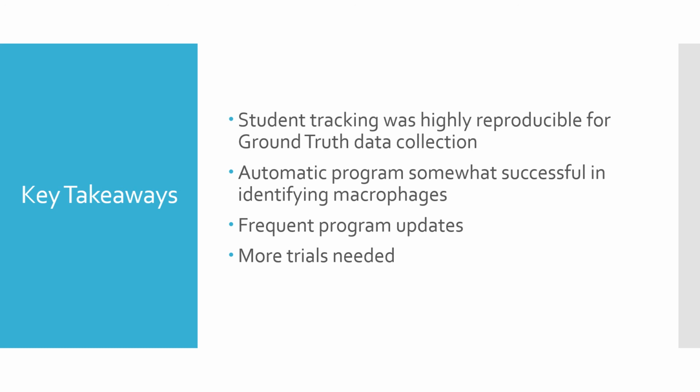Based on this ground truth data, the automatic program was shown to be somewhat successful in macrophage identification, but requires further development to account for the identified sources of error. By completing more trials, we hope to continue troubleshooting and improving this program for the future to hopefully study ADCP kinetics without the need for manual analysis.